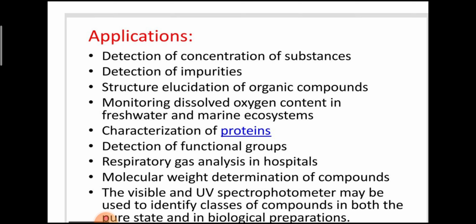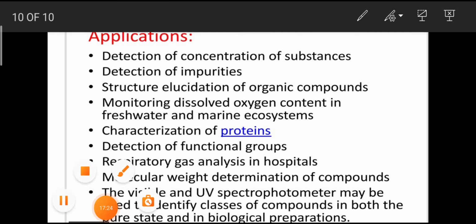The visible and UV spectrophotometer may be used to identify classes of compounds in both the pure state and in biological preparations.